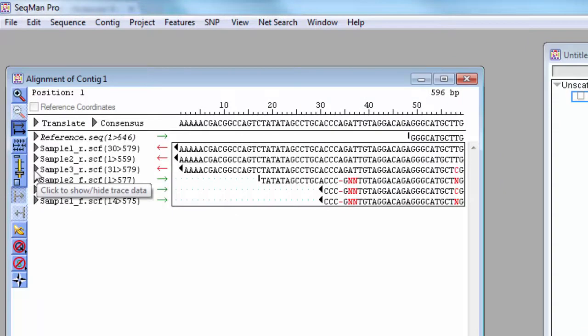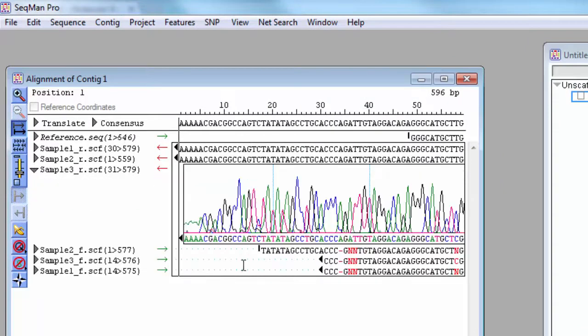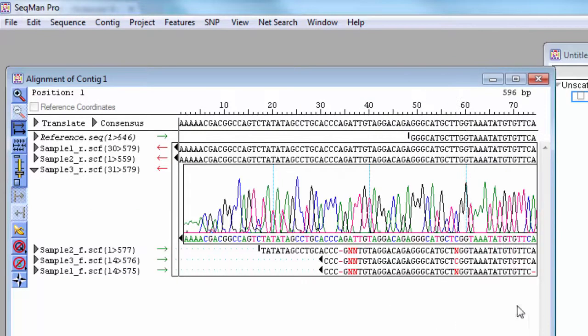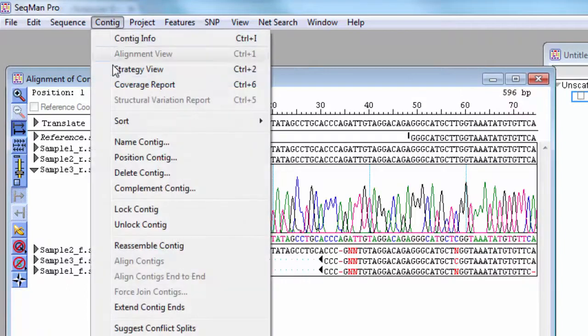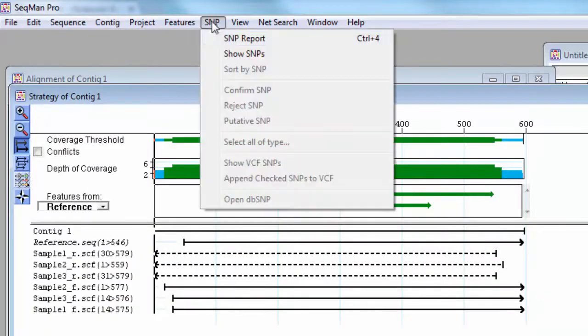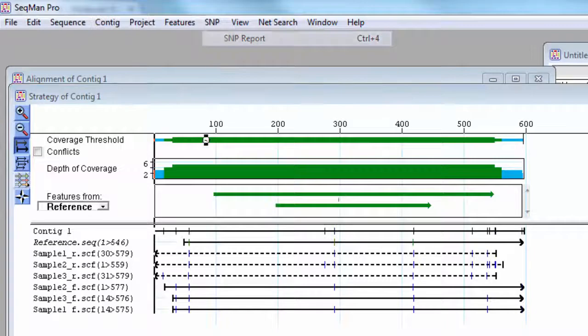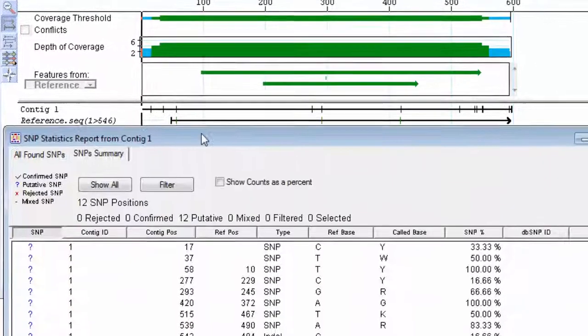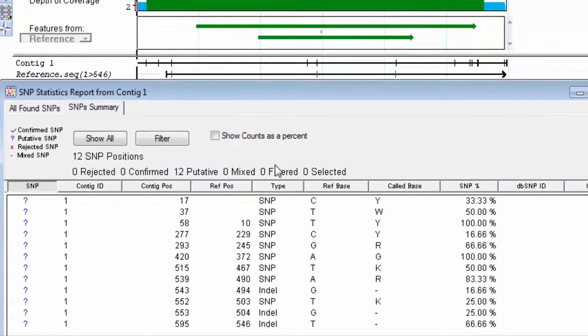Following assembly, you can view the read alignment, evaluate coverage, assess SNPs, and annotate the consensus sequence.